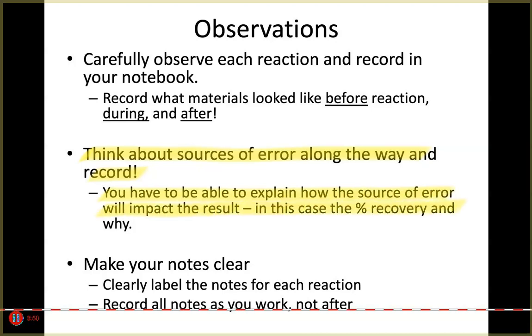So go through, and you're asking yourself mostly why, right? Think, if I was doing this experiment following the technique, and you absolutely must look at the lab manual to do that, because other than that, it's just words. So make sure you're reading your lab manual and think, where would the sources of error be? And this is for any time you do science. Again, it's like when I was talking about recording things versus screwing around. Making sure your notes are clear.